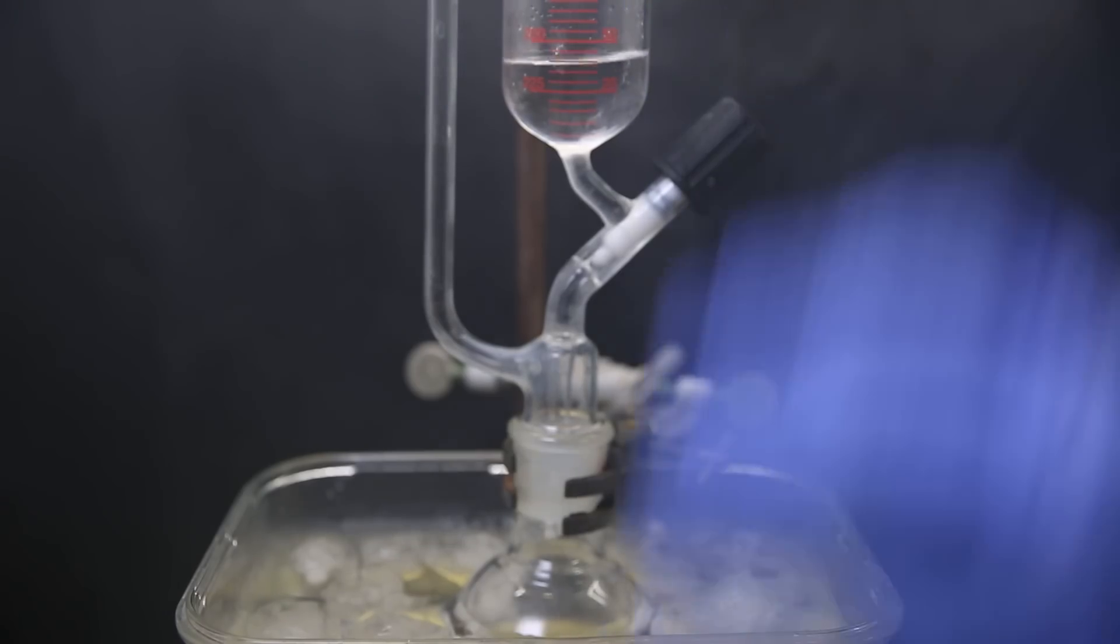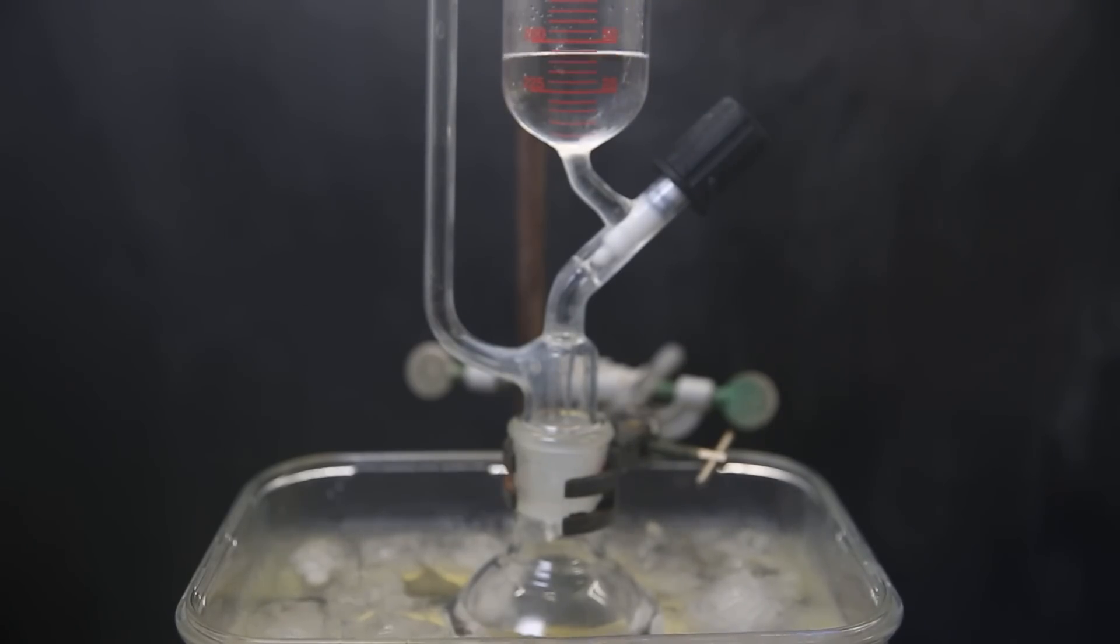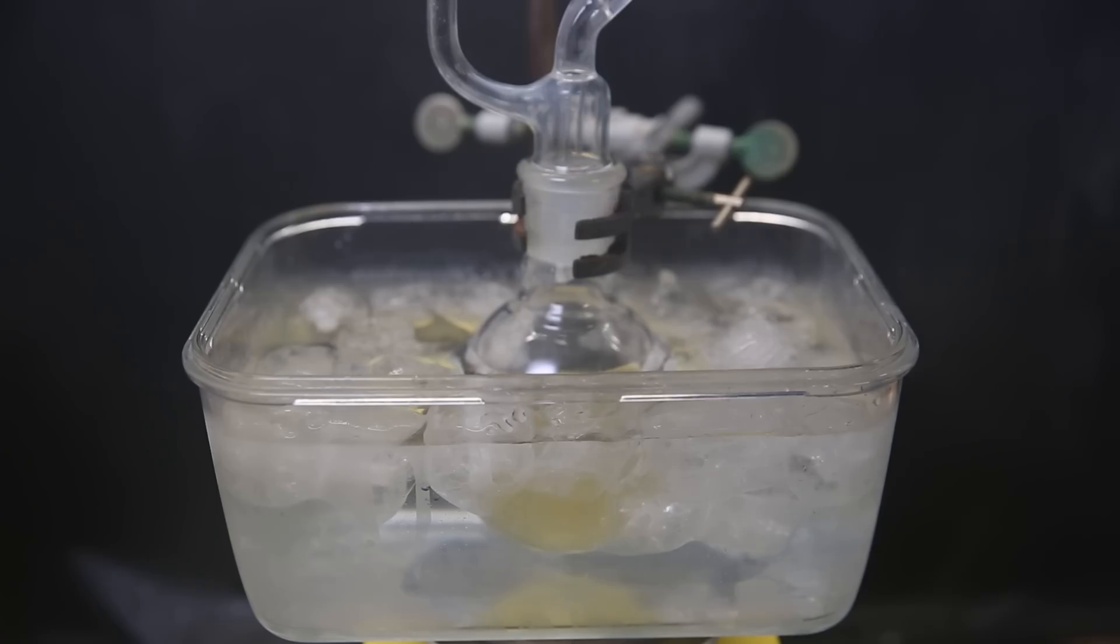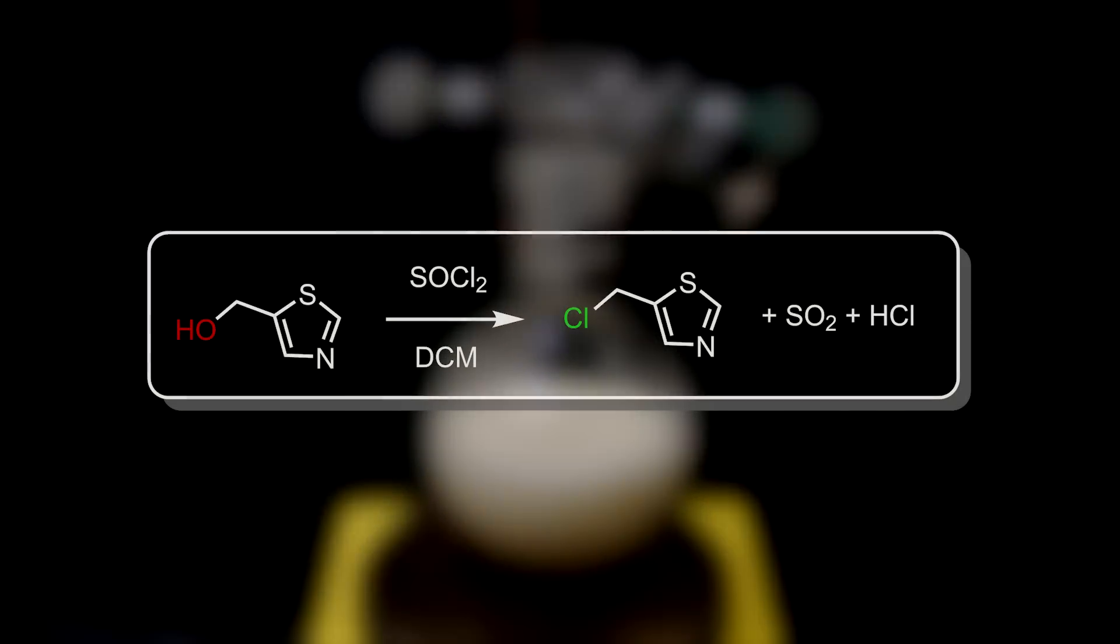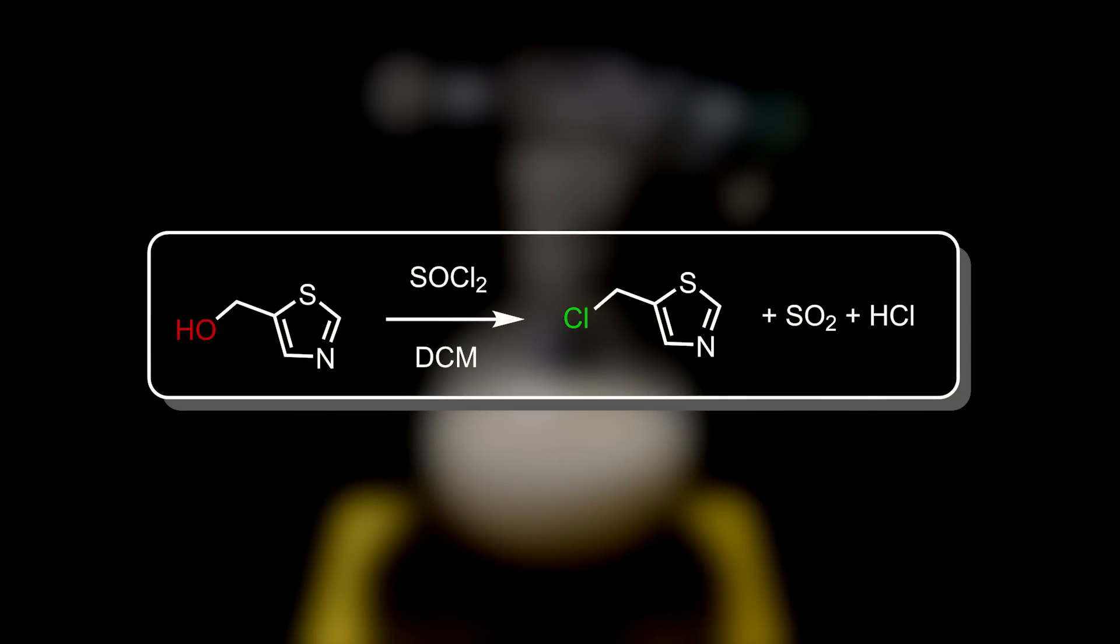I slowly drop in the mixture into the flask and it reacts immediately, forming a precipitate and becoming cloudy. I let it sit in the ice bath for the duration of the addition, and I then let it stir for 14 hours at room temperature. In this reaction, the hydroxyl reacts with thionyl chloride and is replaced by a chlorine, releasing sulfur dioxide and hydrogen chloride gas.